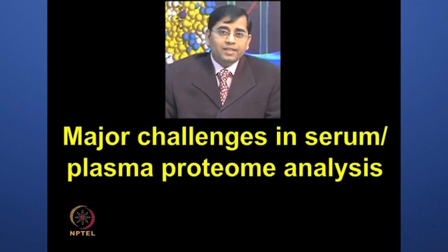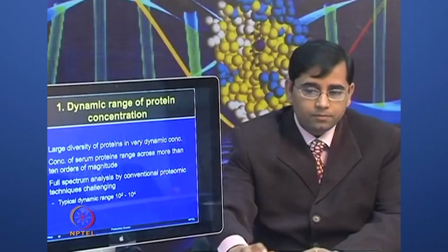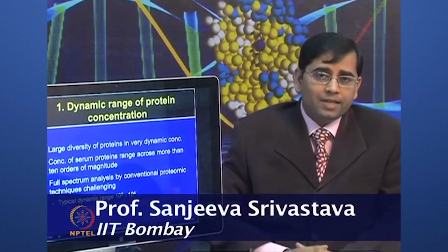Although sample removal is easy, the sample analysis, the serum or plasma proteome analysis, is not so easy. There are major challenges in serum or plasma proteome analysis. Let us talk about some of these challenges point-wise.